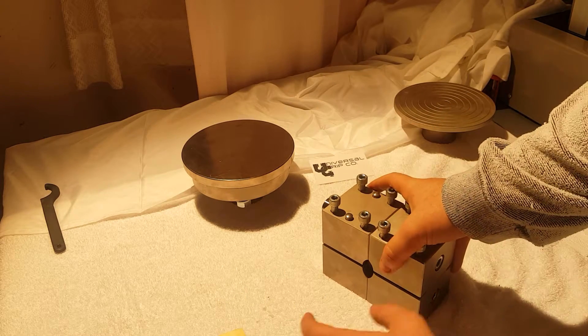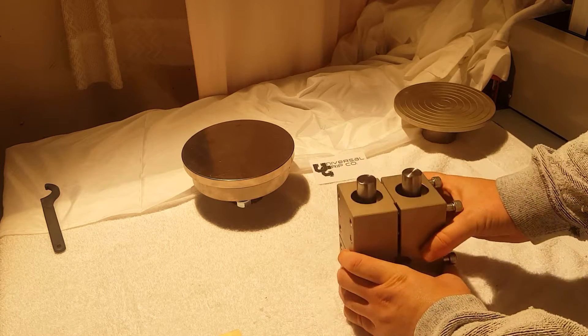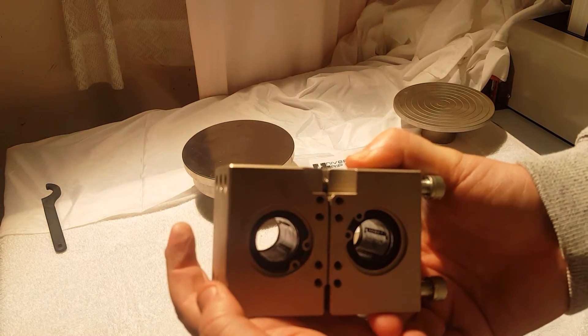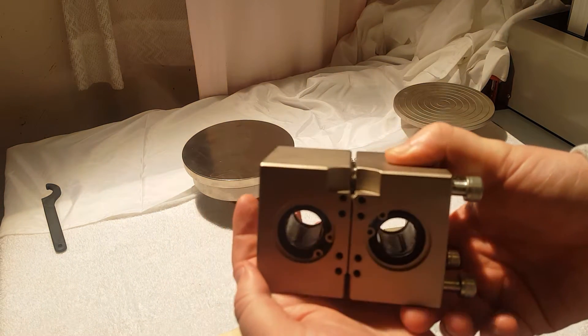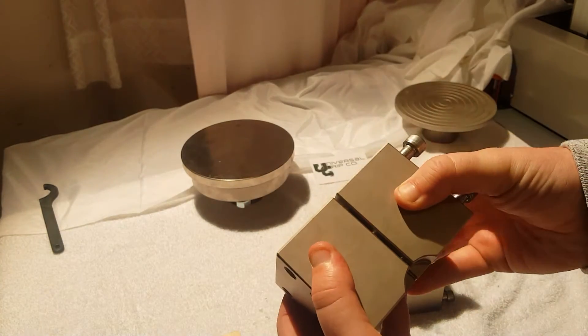I think we're loose enough here. Going to open up the fixture and take the top off. You'll see the bearings inside — this actually rolls with very little friction. It's a high quality fixture.